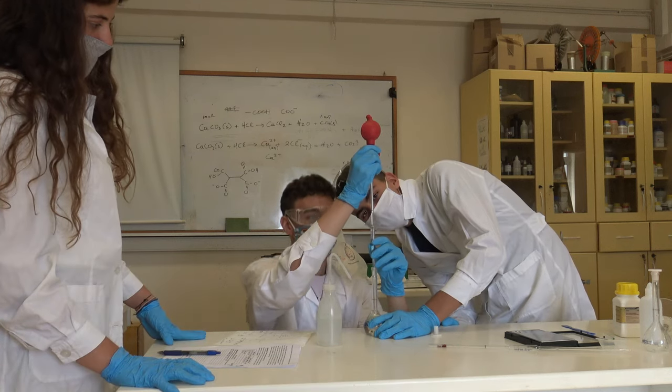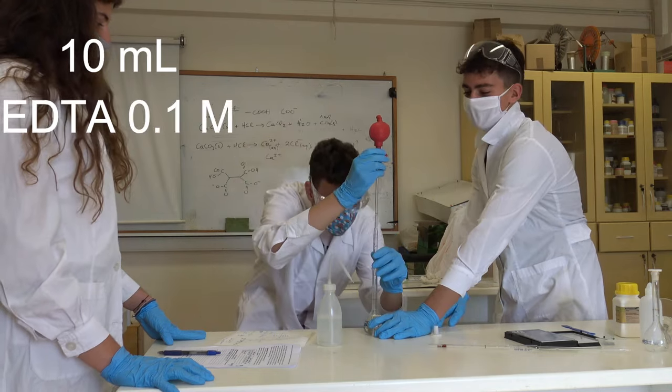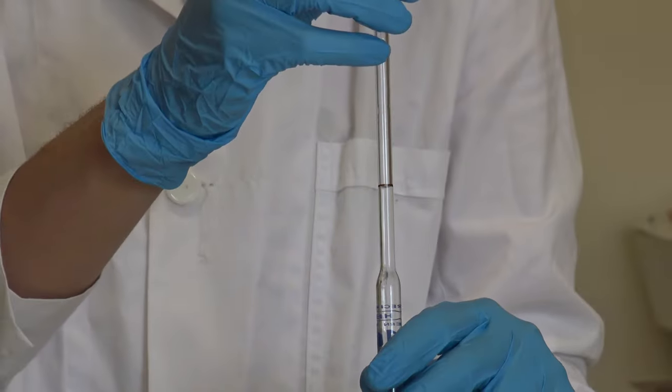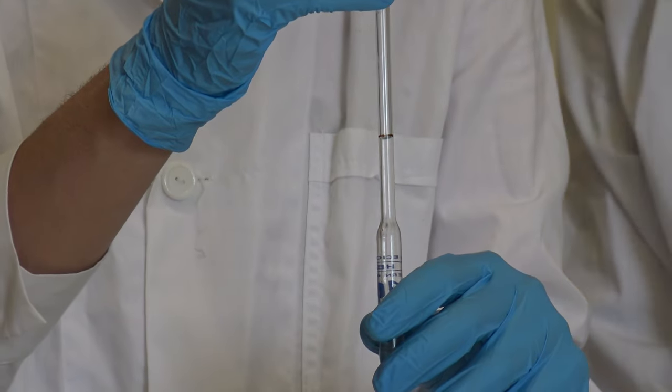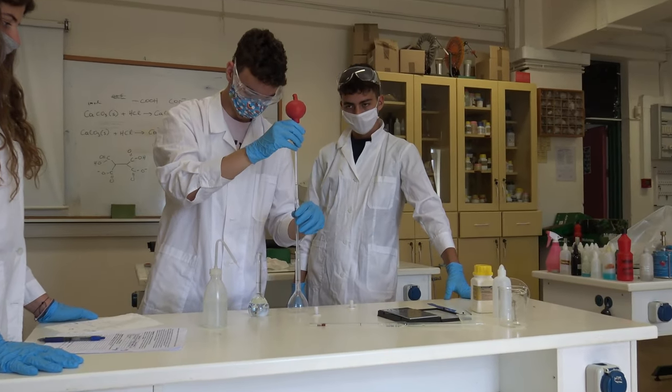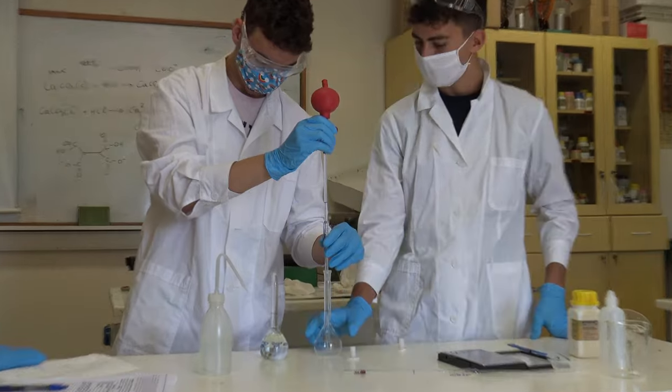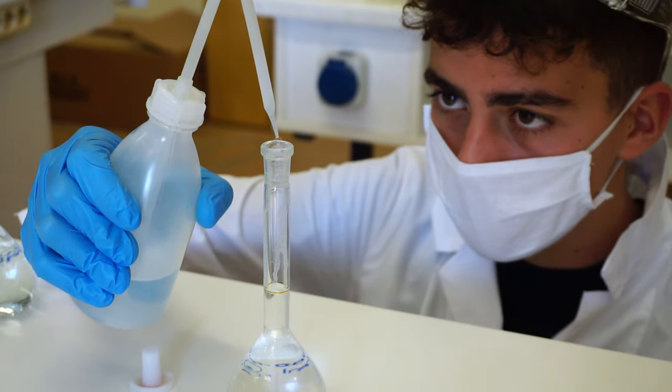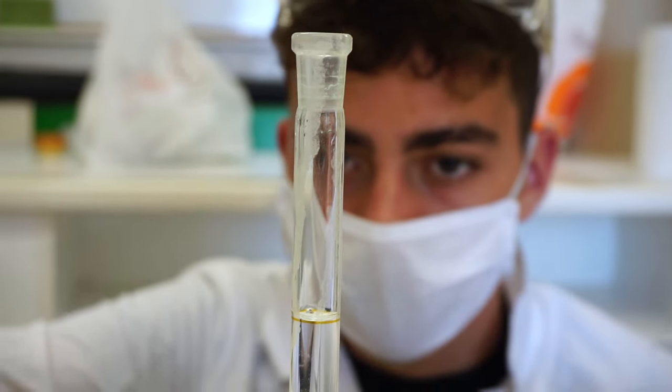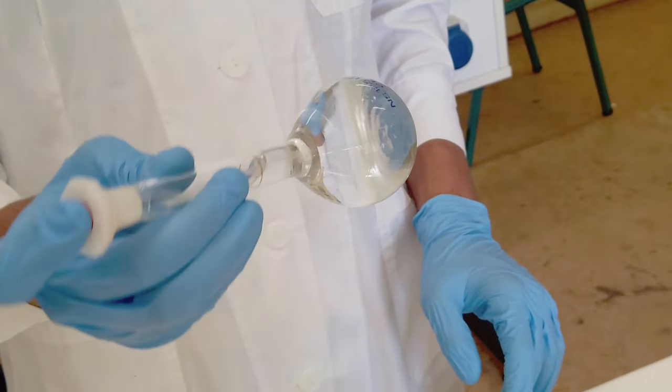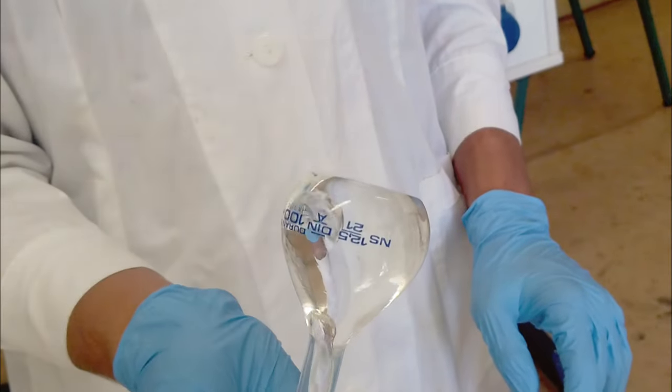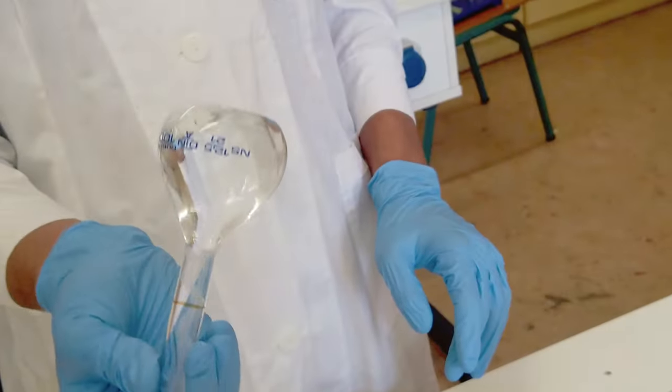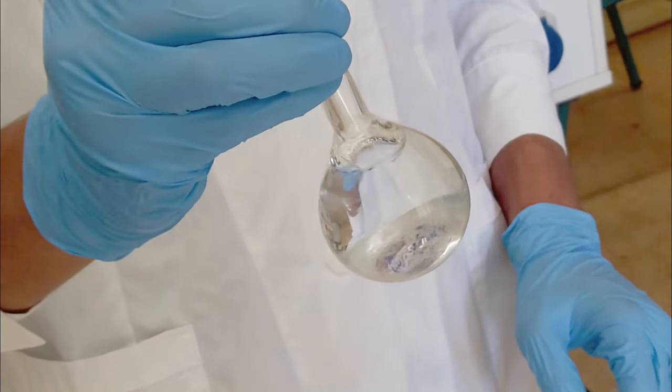From the 0.1 molar solution we aspirated 10 ml and diluted to 100 ml by adding deionized water, thus preparing the working 0.01 molar EDTA solution. This solution will be used for the titration later on.